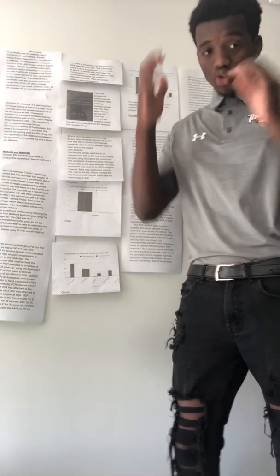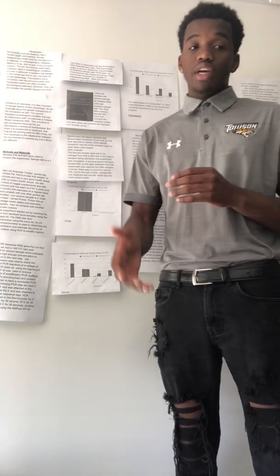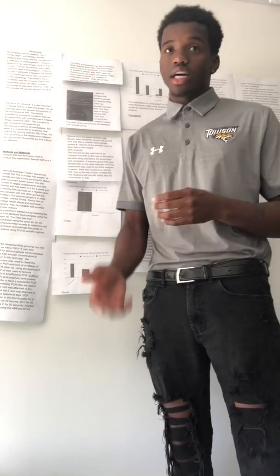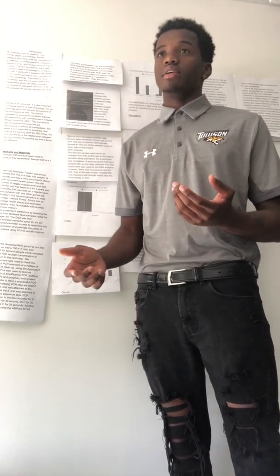This can also be seen through the different percentages of similar orders' reads and through the orders of the two animals that did not share. And lastly, the similar genera between the two animals, other than unclassified, also show how different the gut microbiomes are.